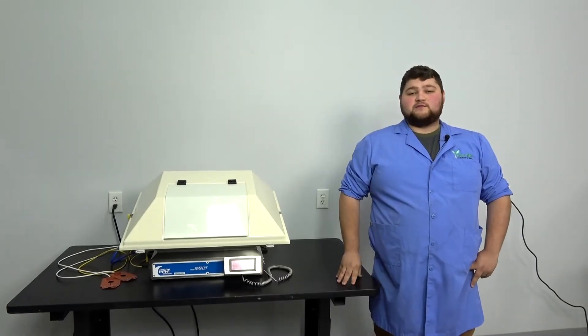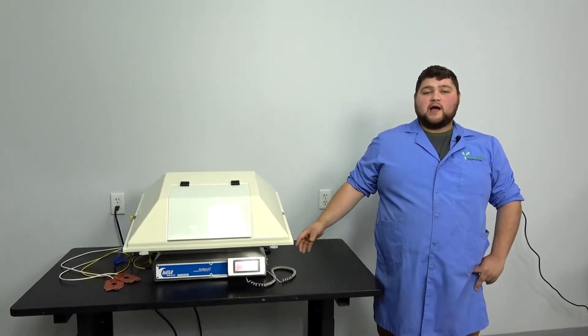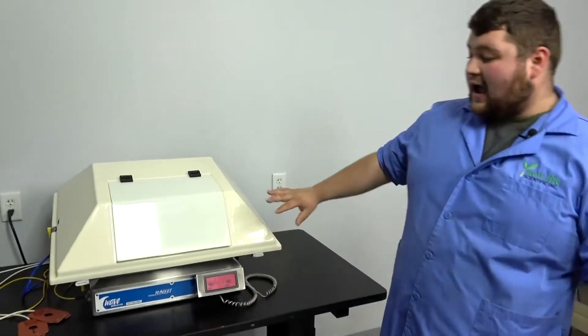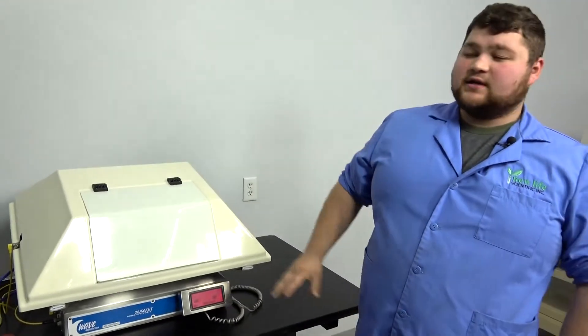Hi, I'm Robert with New Life Scientific, here to talk about this Wave Bioreactor. We've just got it finished up, and it's a rocking table that takes the fluid bag.